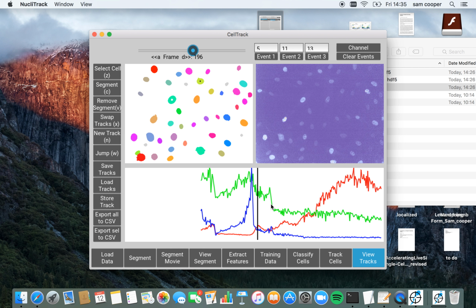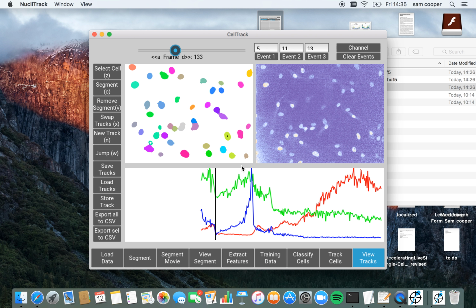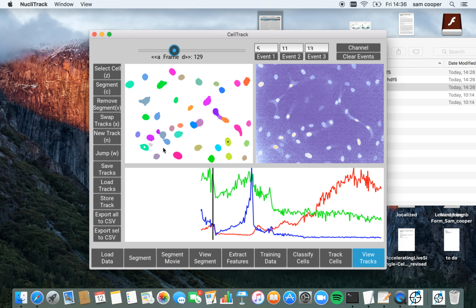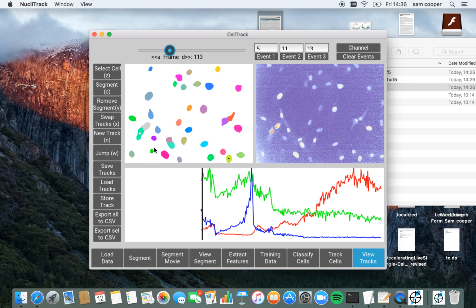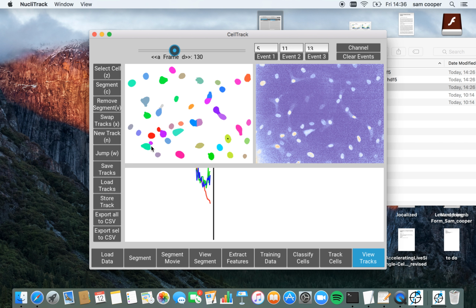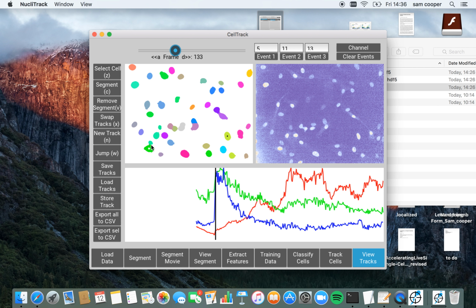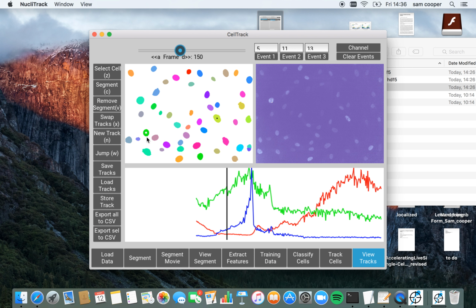And so here's another track, and this track again looks very nice. We've got the cell entering S phase here, where it switches off P21, so we can follow it quite nicely. Oh, it has undergone a mistake there. So let's just correct that. Let's take this cell here. I can be a little bit rough with how I handle data because we're just interested in the overall trend that's happening.